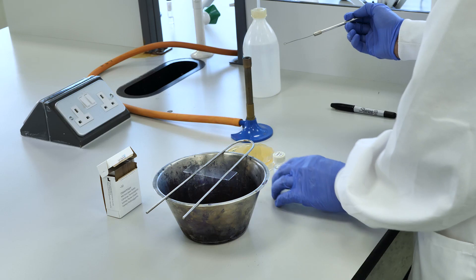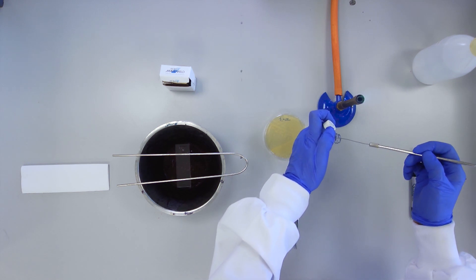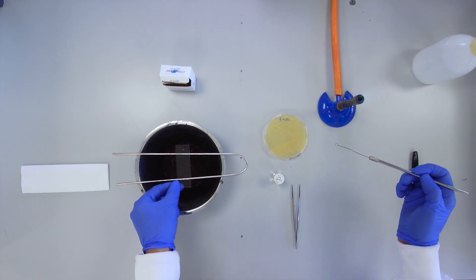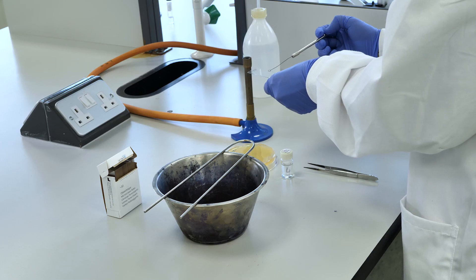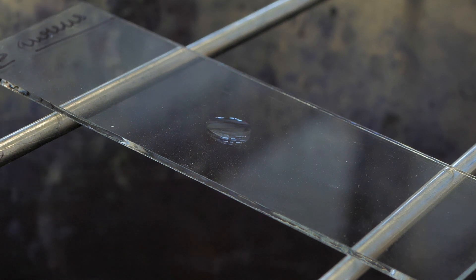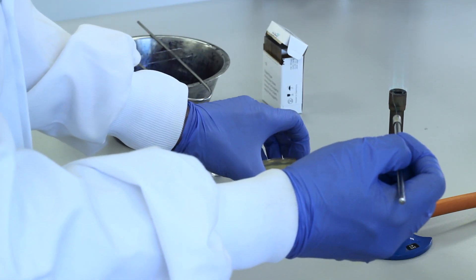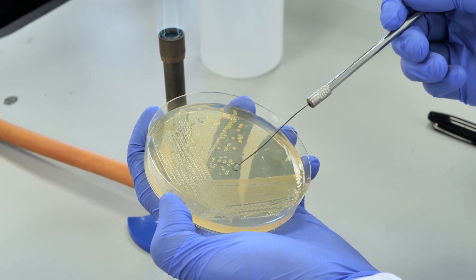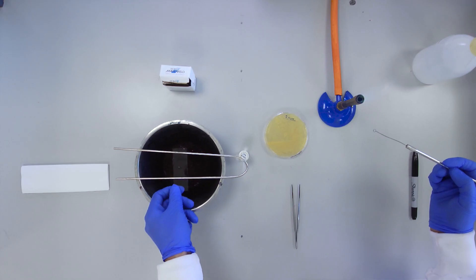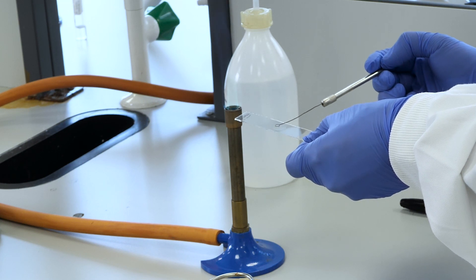Transfer a small drop of water aseptically onto the centre of the slide using a wire loop. Aseptically take a small quantity of a colony from an agar plate on which the culture of interest is growing. Transfer this culture to the water drop on the slide and spread as shown until the colony and water form an emulsion.